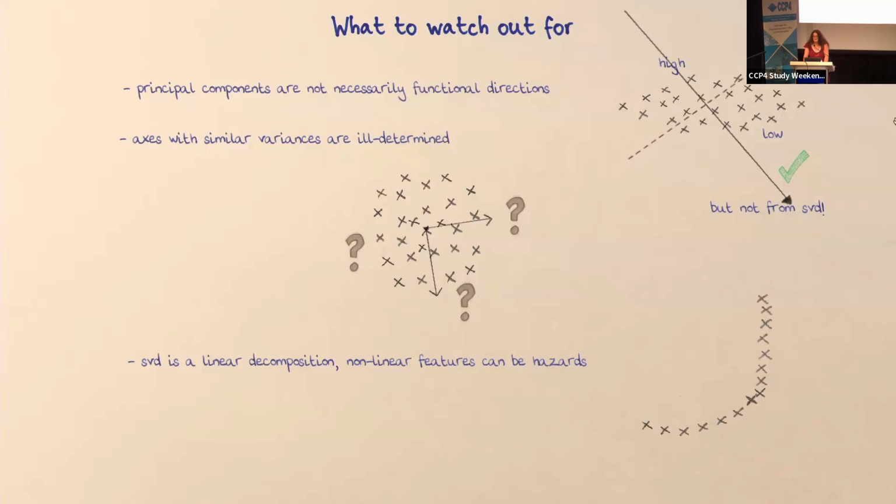So if you have a path of structures like this, and you look at the SVD axes, you'll get 2 variances here. You don't have to define the data set this way. You could also define it as a proportion along a curve. So do bear in mind that SVD will generally report more dimensions than you may actually want to use, and don't interpret it as the number of states in your structures, because that isn't necessarily the case either. Just always bear these things in mind.